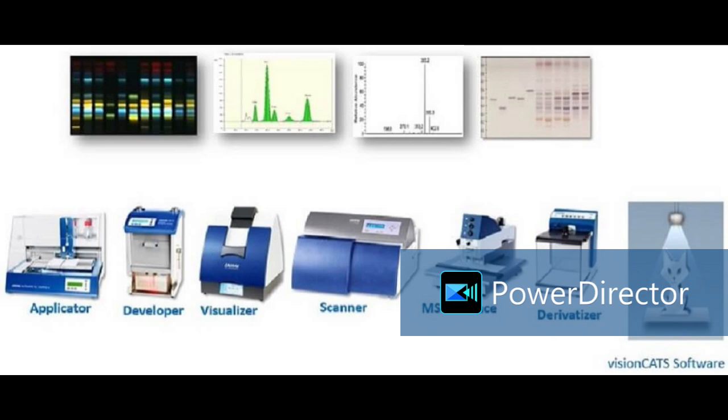So you can see sulfamethoxazole, trimethoprim, and metronidazole having different absorption spectra. The absorption spectra of each is different. Because what is absorption spectra? It is the property of that molecule to absorb different wavelengths of light.